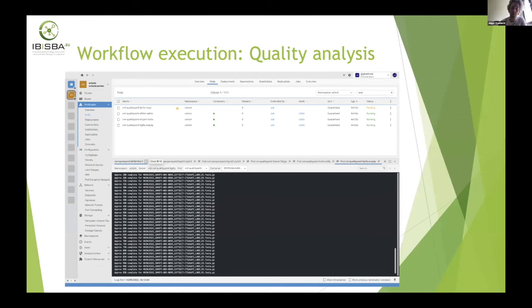And then we can easily push them into our compute analysis. So here I quickly started 4 jobs to see how everything is going. And then we see, okay, everything runs smoothly. We can just start the rest and then it will go autonomously. And then the next day we will get our results.